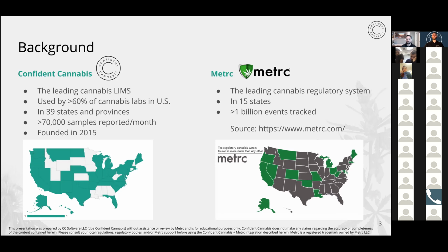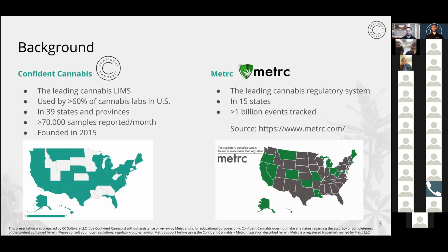So Metrc, this is from their website. They're the leading cannabis regulatory system. They're in 15 states. And again, according to the website, they've tracked over 1 billion events. So very much becoming the standard in the cannabis industry for track and trace.